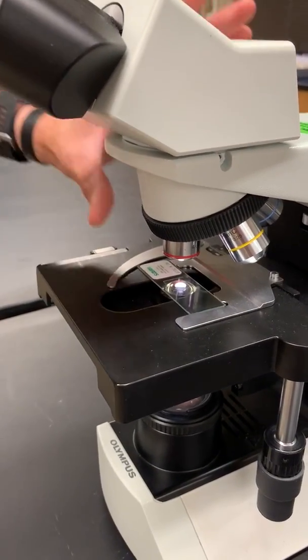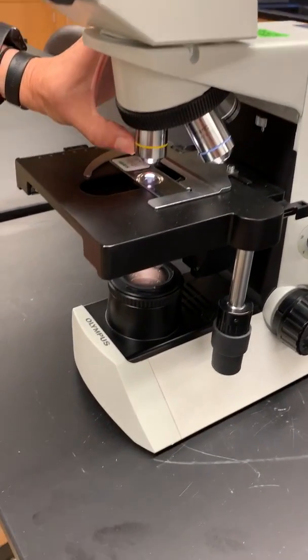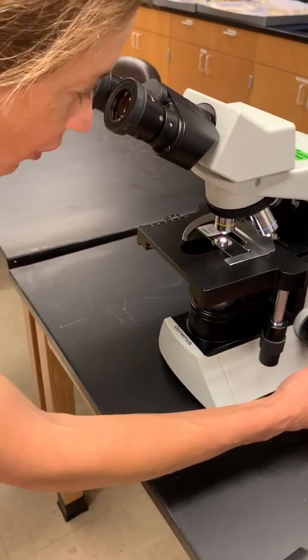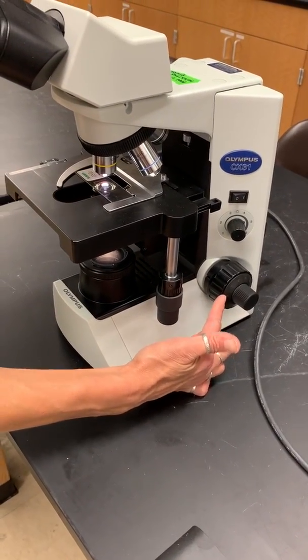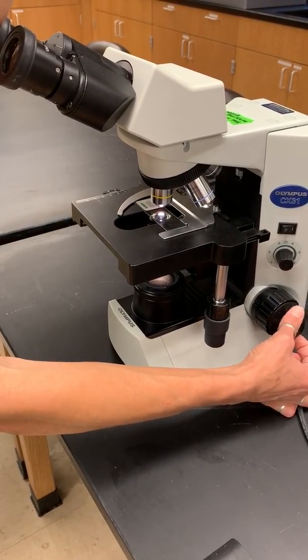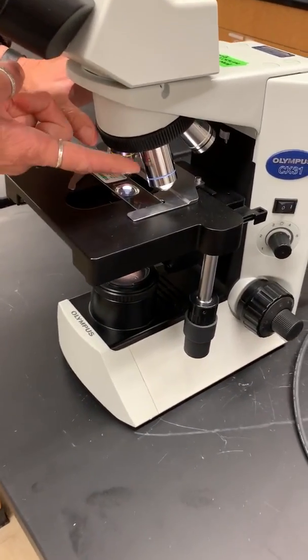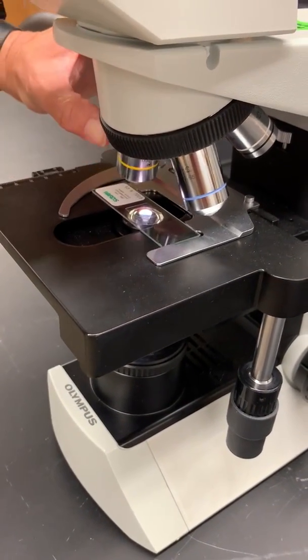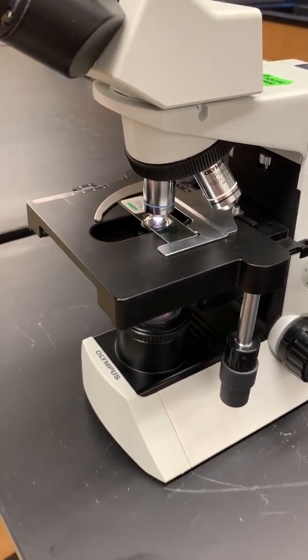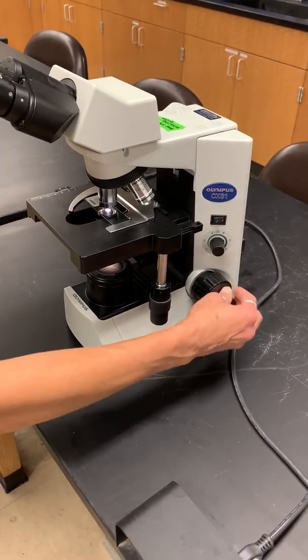Once everything looks good, I can go up in magnification. I'm not going to mess with my knobs anymore — I'm just going to go over to my next objective, the one with the yellow line. This is a 10x objective. Things are going to be a little bit blurry, but I'm not going to touch my big knob, my coarse focus. I'm only going to move my fine focus knob until the image looks clear again. The biggest magnification we're using is this 40x objective with the blue line. Once it looks good, I'm not going to mess with my focus — I'll just slide it over and use my fine focus knob to get a sharper image.